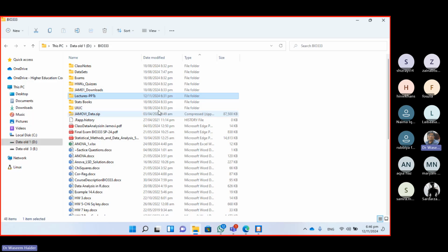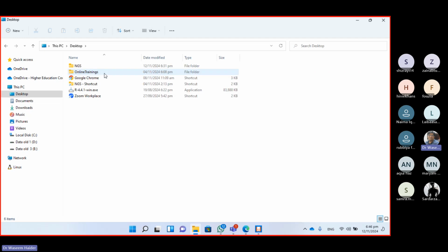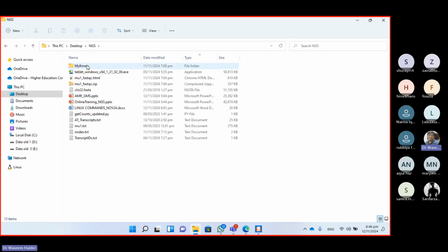The commands, let me open them and place them here on the desktop. And yes, these are your commands.